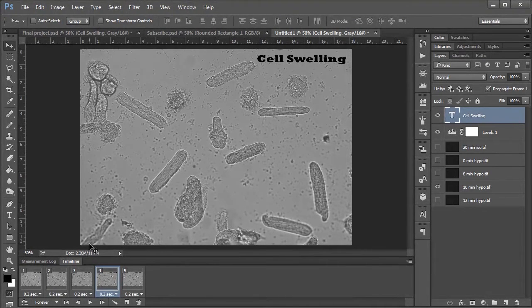And then next, I wanted to show how to add an arrow to point out a particular feature or cell that might be interesting. So I'm on frame 4 here, which I'll just stick with. And so say there's something interesting going on in here, and I wanted to freeze this frame for a bit. Instead of 0.2 seconds, I might set it to, let's say, 1 second.